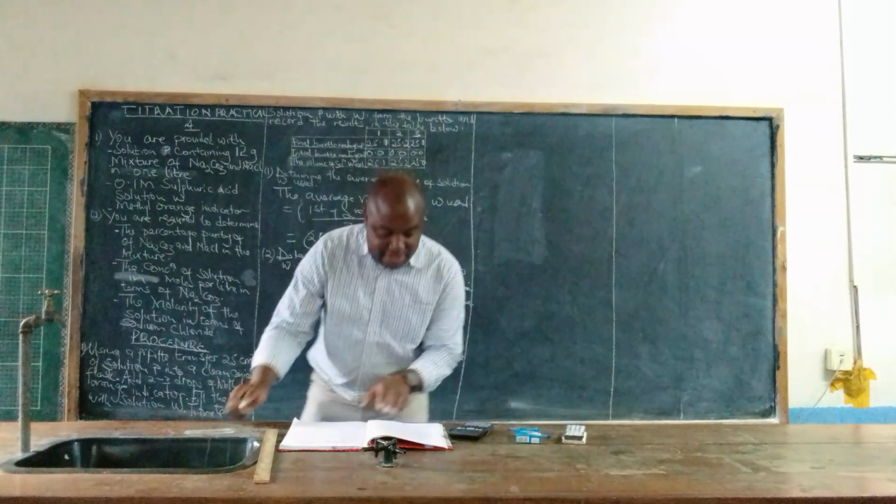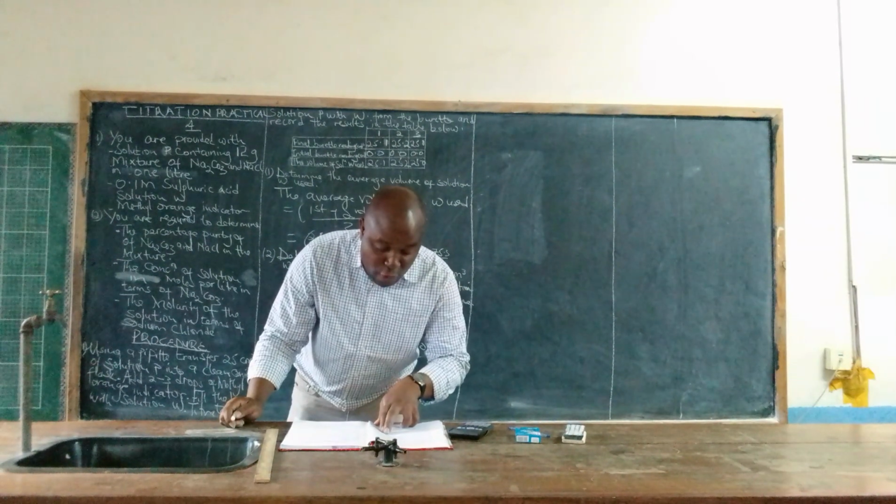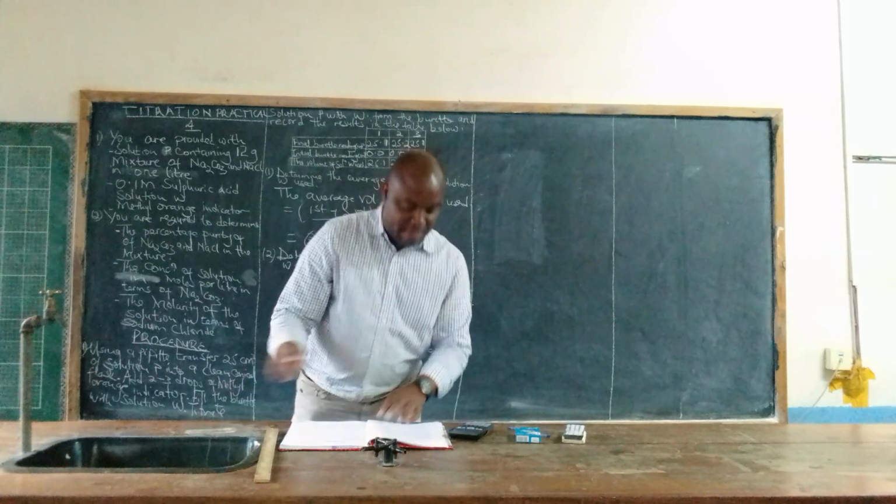So we have been asked, determine the number of moles of sodium carbonate in solution P that reacted.